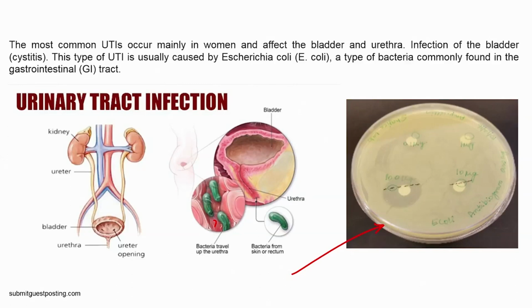This is a disc diffusion technique, also called antibiogram assay, and what you can see here is ampicillin, which is one of the antibiotics for E. coli.